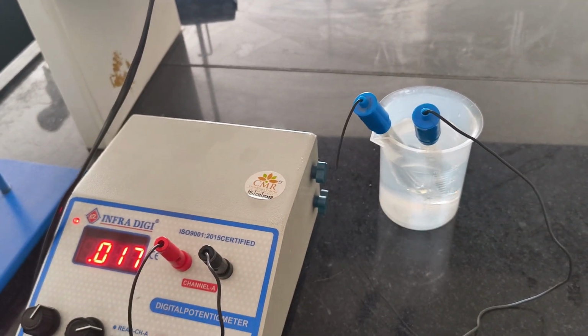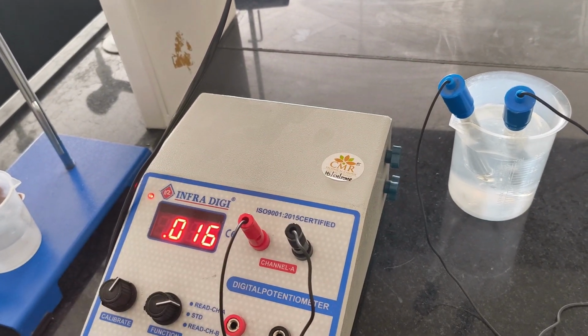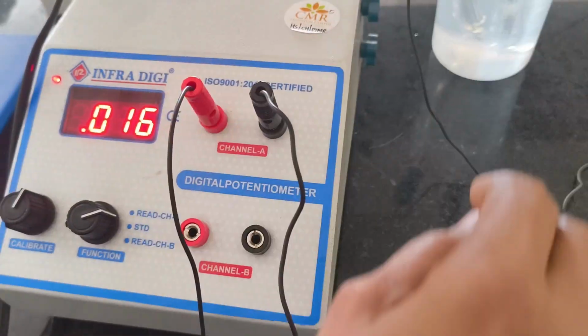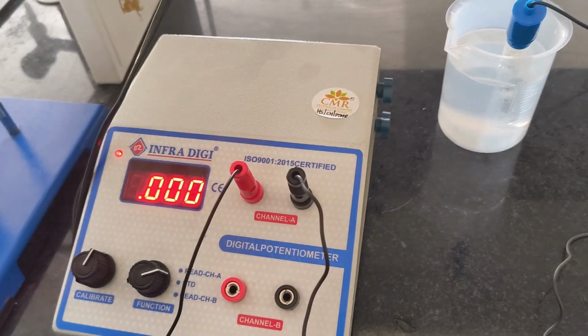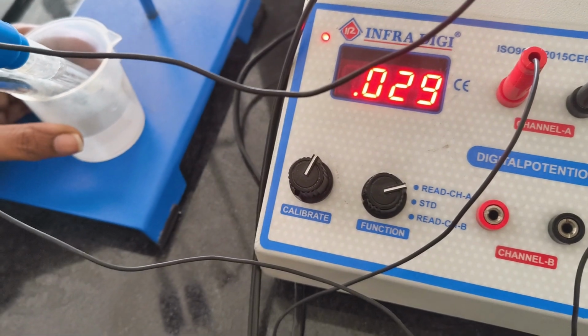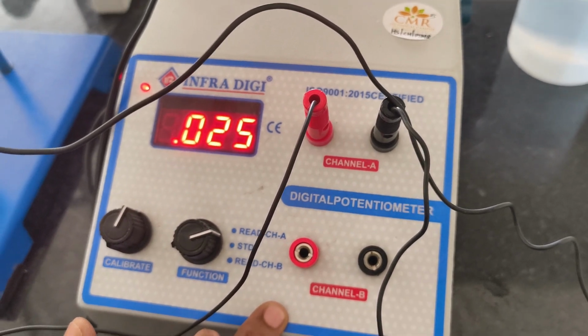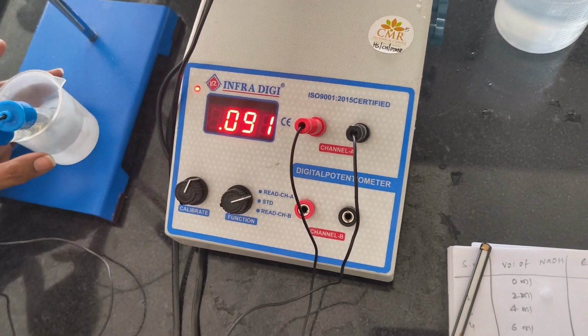By using the wires we have to connect these two electrodes to the potentiometer and we have to standardize this potentiometer. After connecting the two electrodes we have to switch on the potentiometer. Then we have to put these two electrodes from the water into the HCl solution. We are placing the platinum electrode and calomel electrode into the HCl solution and connecting them to the digital potentiometer.